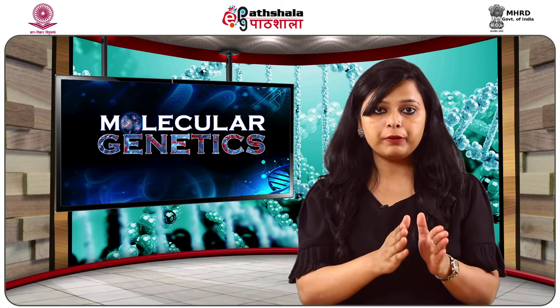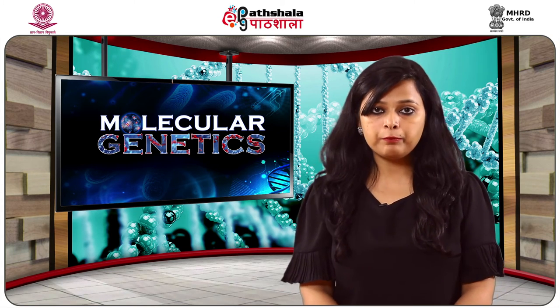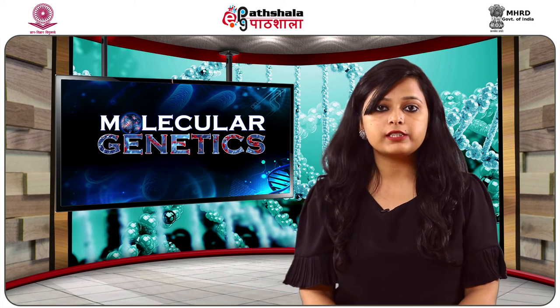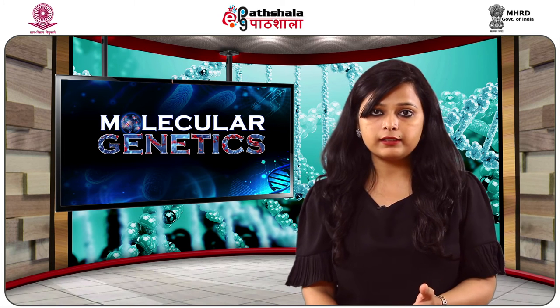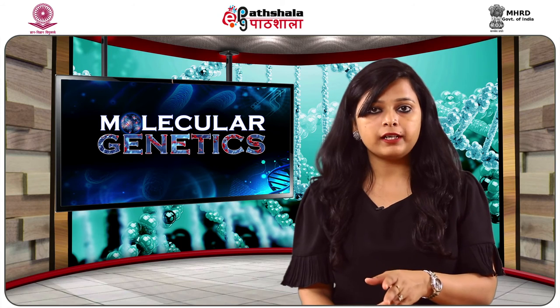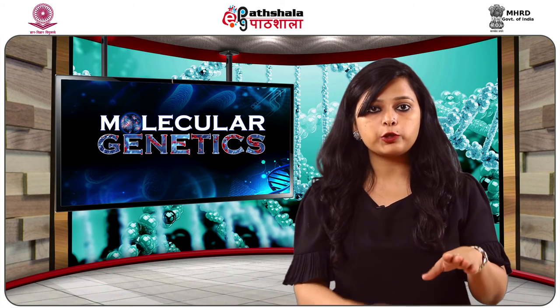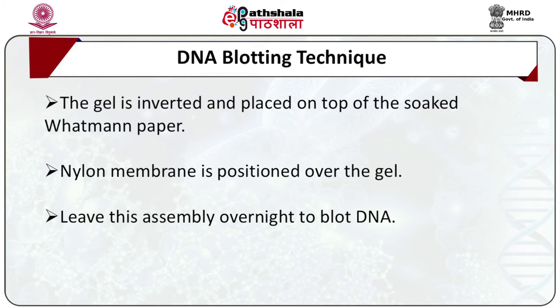The Southern blot assembly is then set up by cutting two pieces of Whatman 3 mm paper and one piece of nylon membrane about 1 mm larger than the gel in both dimensions. Also, a stack of blotting sheets, approximately 8 cm in height, is cut to the same size as the gel. One piece of Whatman 3 mm paper is soaked in 20x SSC and laid in the plastic tray. The gel is inverted and placed well side facing downwards on top of the soaked Whatman paper.